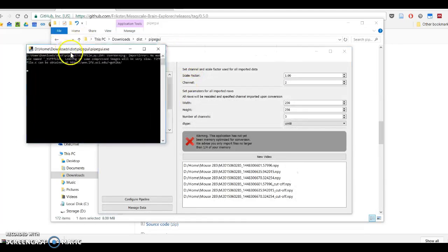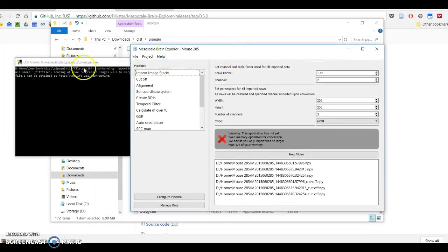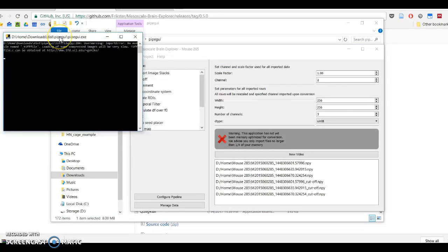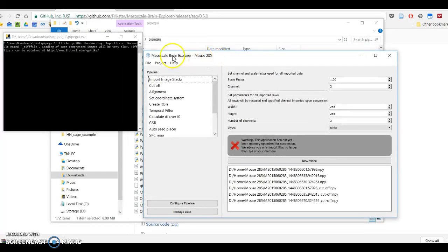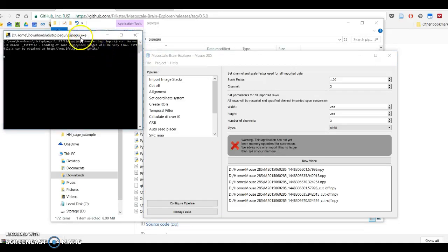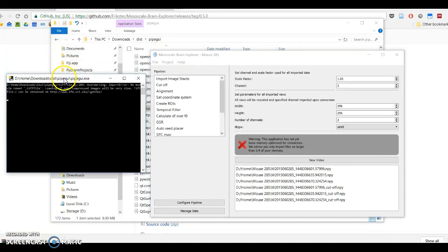So right now you can ignore the terminal window that appears on the left. This is used for debugging purposes. It is not going to be involved in the final, non-beta release of the application. This error warning that appears on the left does not occur when you run the application, say, via PyCharm, so via a developer menu, and I actually have yet to figure out how to get rid of it.